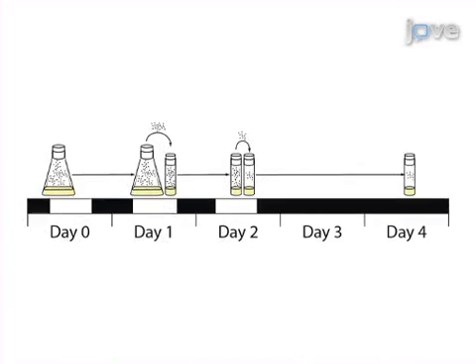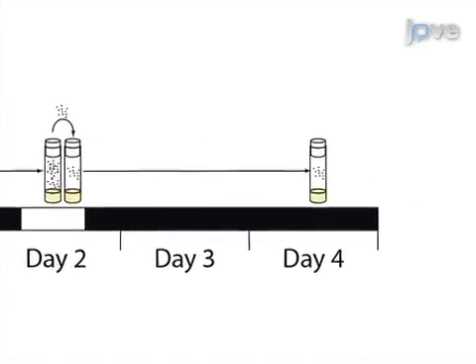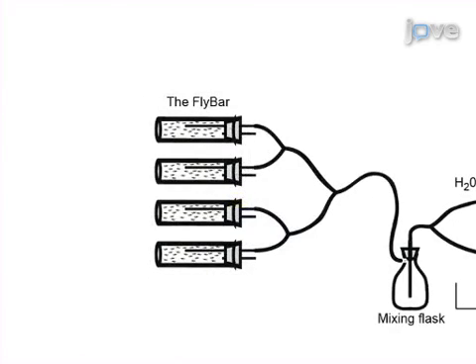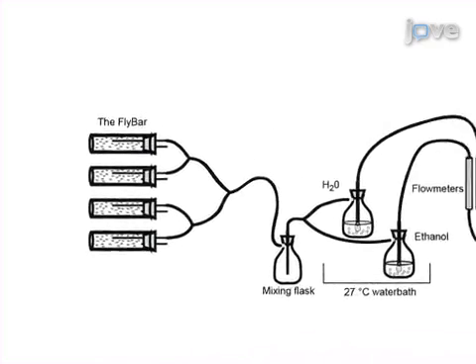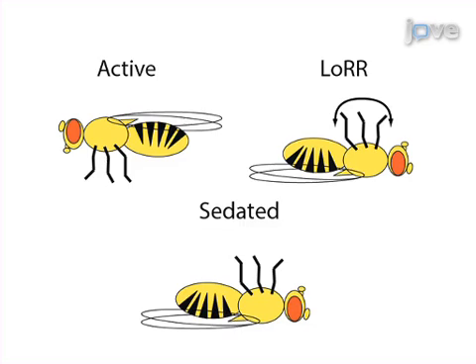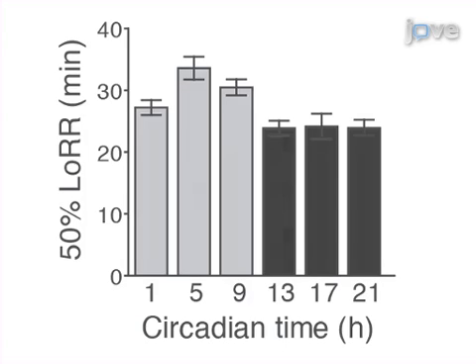The next step of the procedure is to culture Drosophila under specified light-dark cycles and collect age-matched flies for the experiment. Then, the flies are exposed to defined concentrations of alcohol vapor and the data is collected. Ultimately, measuring the loss of righting reflex or sedation can show differences in alcohol sensitivity between groups, either based on time of day or genetics.